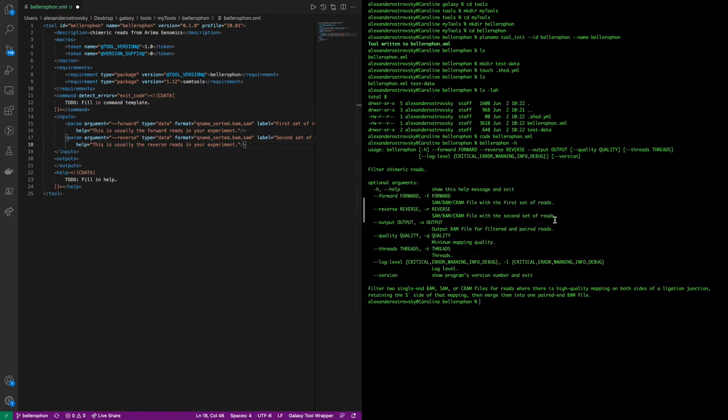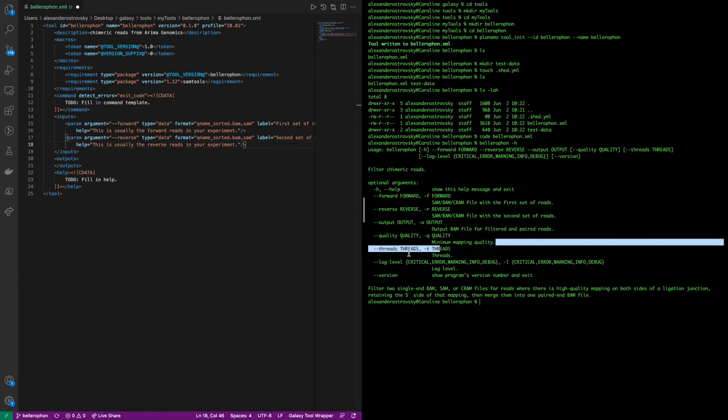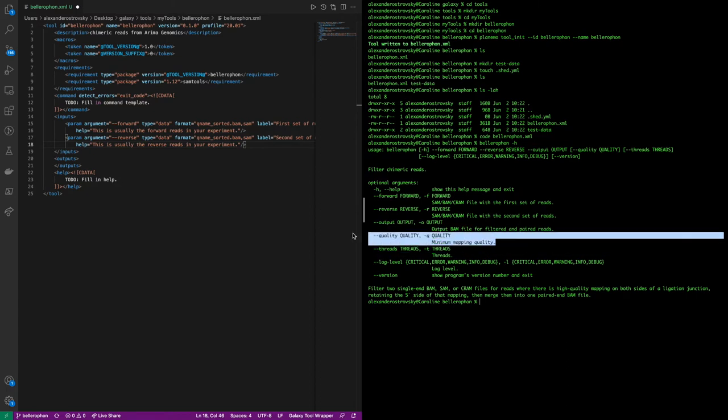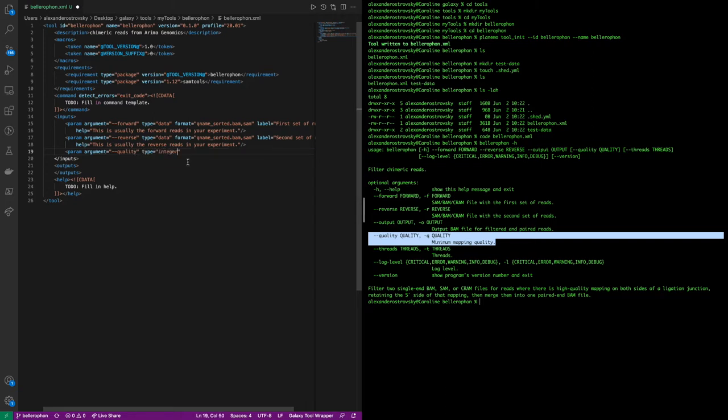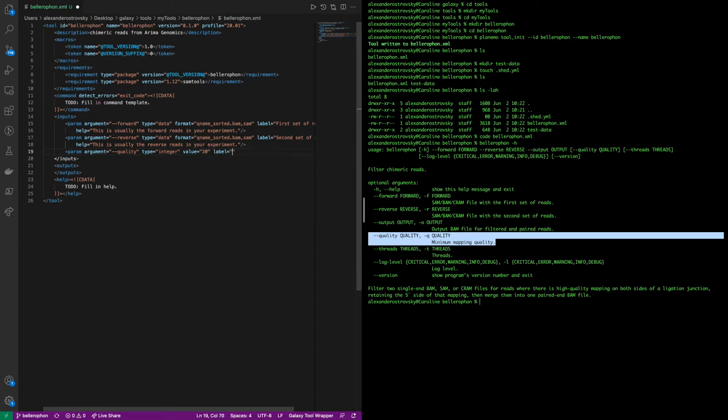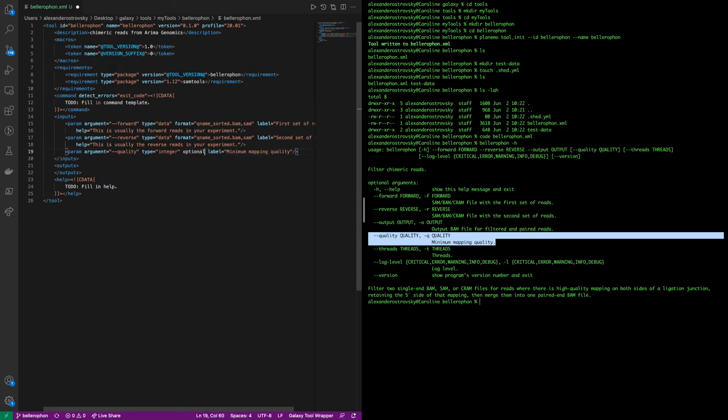As I said before, although the next parameter listed in the help section is output, we will be specifying an output file manually in the command section, and therefore the next parameter in the input section is quality. Similarly to before, we set up a parameter and label it with an argument. However, the type this time is an integer, and therefore we specify that as the type. Other input formats are available, and those are listed in the galaxy help section or in the associated training. As this is a required input, we set a default value. So this will show up in the GUI as a pre-filled in text box. However, if we didn't want that to be a default, and we wanted the user to be able to skip this, we could always set this as optional instead. We will however be leaving this as the default value of 20.